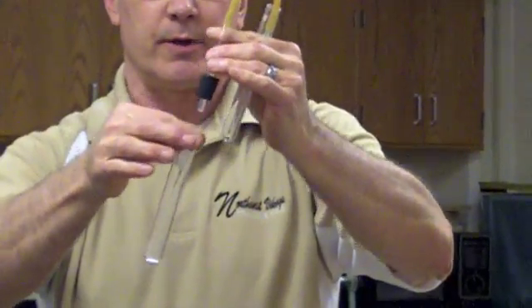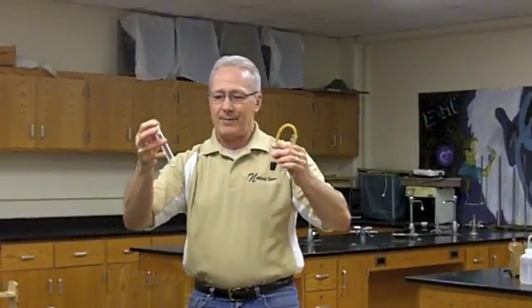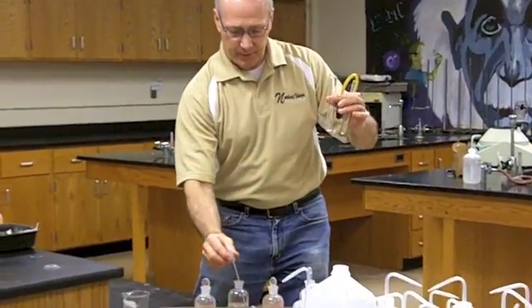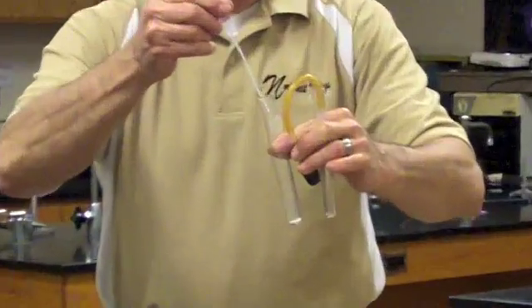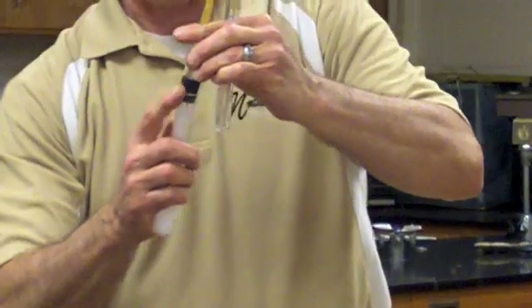Now before I do this, what I want to do is add some acetic acid. And what we're looking for is to see what happens when you put acetic acid with a known carbonate. So we're going to go ahead and do that now. And I have here acetic acid, and you just take an eyedropper full and go ahead and squirt it straight in, and then quickly put the stopper in.